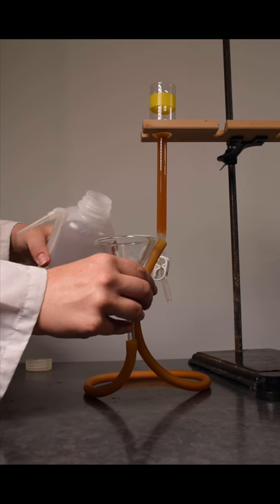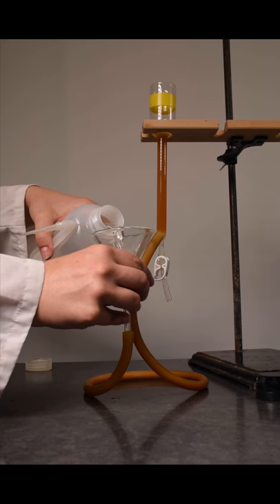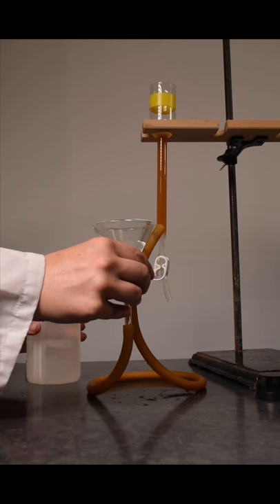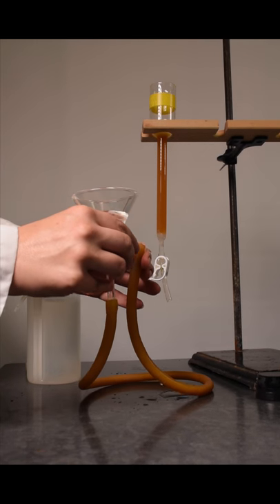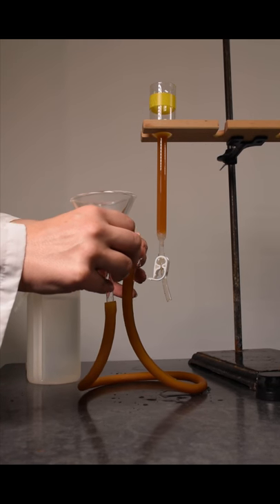Hold the funnel and the end of the tubing. Fill the funnel and tubing with deionized water. Gently raise the funnel up and down to remove any bubbles.